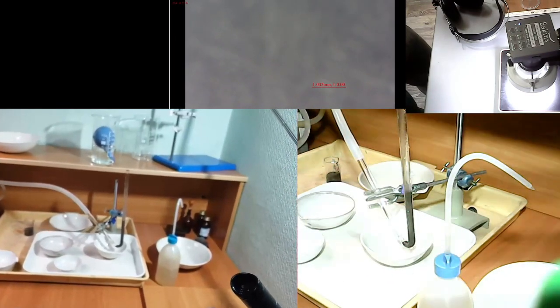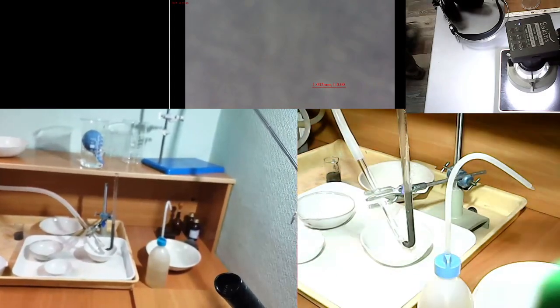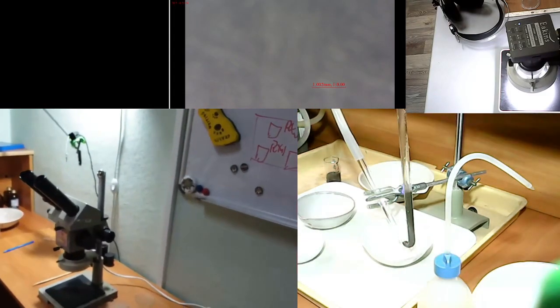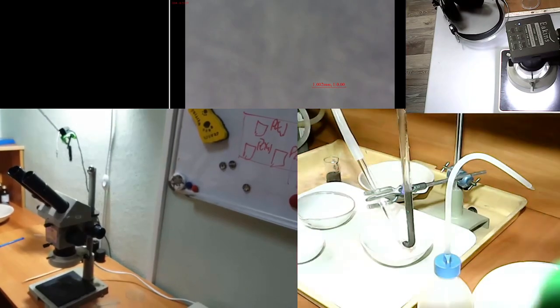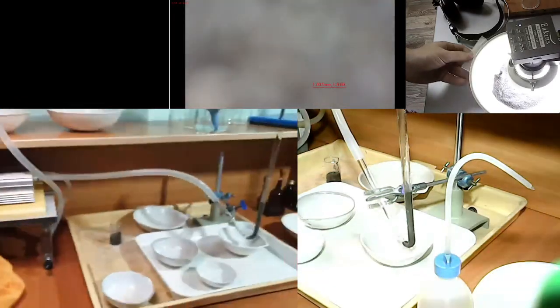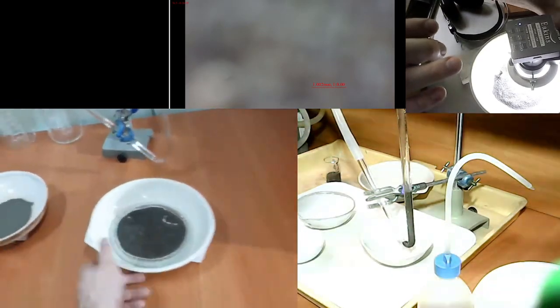We need a little bit of space for some amount of material to spread through nicely through the glass separation tubes through the whole length. So to make sure we have separation process, some particles stream down, another go up. So you can see how it's working.